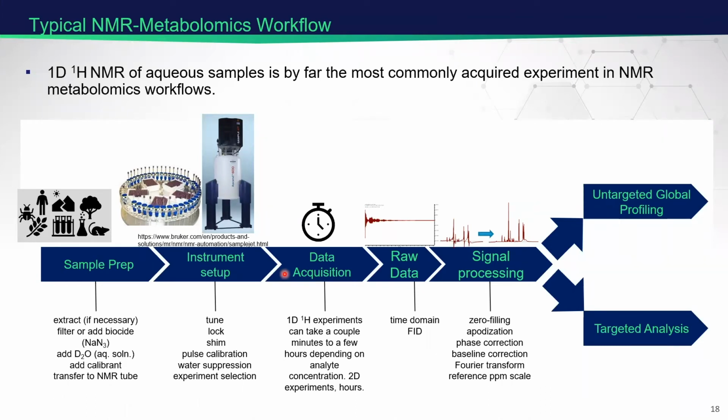But regardless, in any study, the sequence of events is much like any other analysis, except there are differences when it comes to the sample prep as to what's necessary. And then we have to get it on the instrument, acquire the data, get the signal into a form that's easier for us to interpret, and then decide how we're going to go about analyzing it.